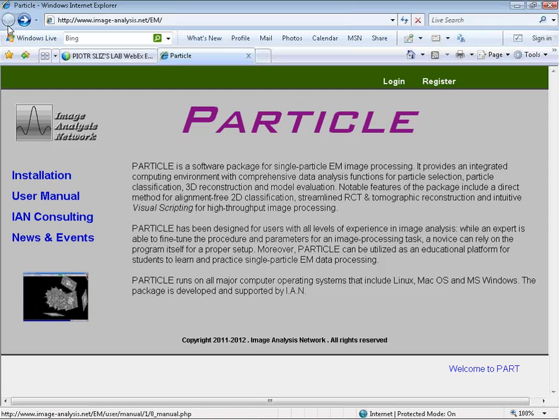In terms of the origin of the software, so you started to write it when you were back at Brandeis, right? But is Nico involved at this point? Who's responsible for development? This is a recent effort in the program development. Yes. So Signature I developed at Brandeis. It was for part of the screening, and that package, the ownership stays in Brandeis. The particle is developed mostly at MIT right now. Yes, it started about a year ago. Okay.